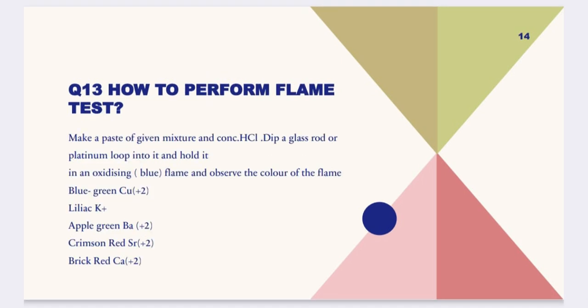Coming to the next question, number 13. How to perform flame test? Make a paste of the given mixture and concentrated HCl.